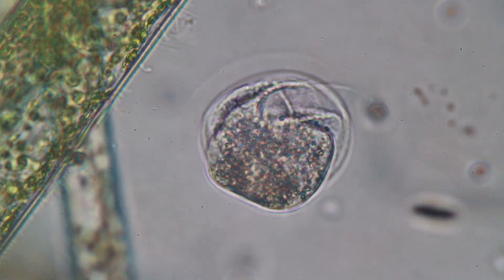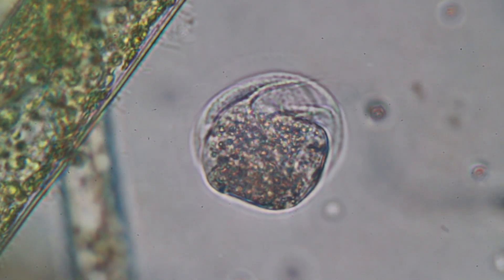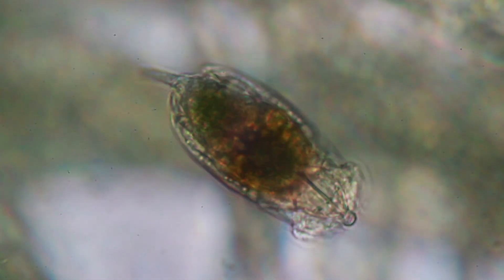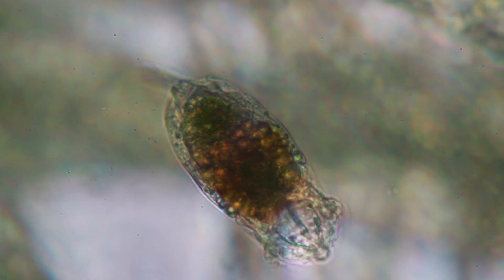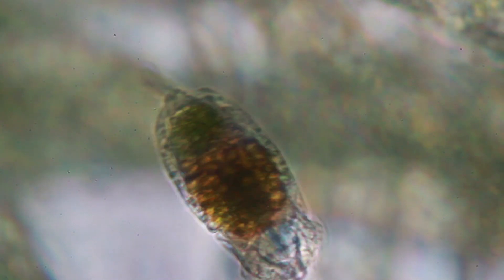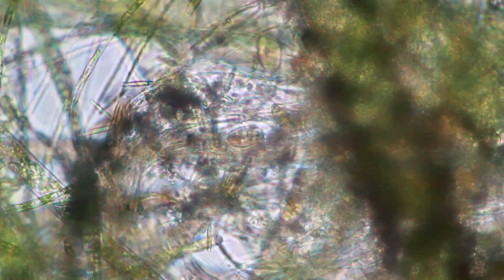I have to check my identification book. One of the things I kind of liked is that you can actually see all of the particles moving around — it's moving the water quite quickly. There seems to be some kind of interesting halo around this organism; I don't know if these are the rapidly beating cilia. There is a small particle on the lower right side moving in a circle, indicating it's also moving the water around for feeding purposes. Unfortunately I did not find more of these. Here are some ciliates caught in the network of algae — it seems to be like a small colony — and a little bit of time lapse to make everything a little bit more exciting.